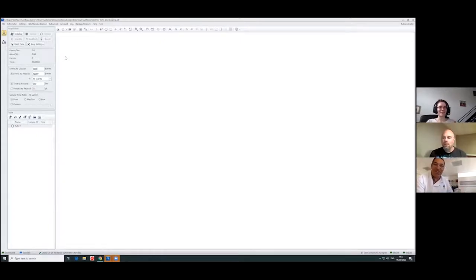What I will do now is I have the sample, and I place it in. These are the QC sample. I'll first initialize the instrument. It's an energy saver. If I'm not doing anything, I'm just talking, it suddenly sleeps a little bit. So that's good. I place it in and I press run.